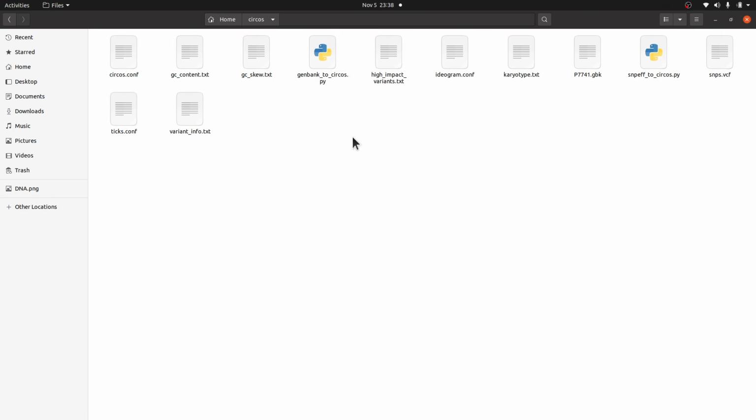Okay, so I'll check it out. So I should see the file. Now, if I don't see it, I'll just go back. I think I'll do it. So let's see. Yeah, okay. Yeah, so the file is here. So there's the file. Okay, so you should see this file also generated. So these are the things that you need.